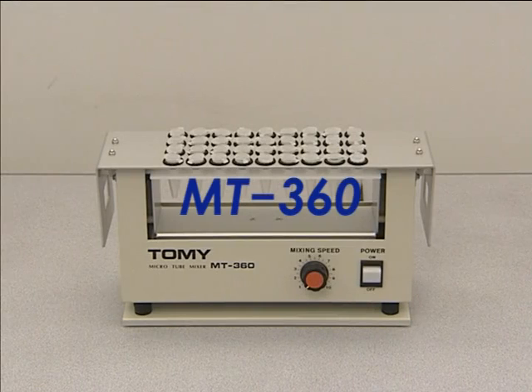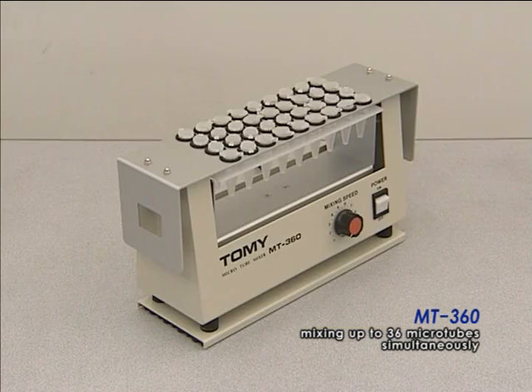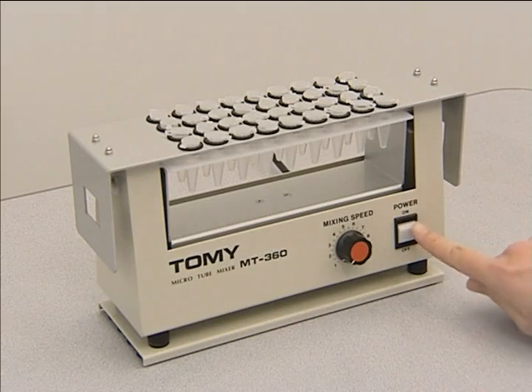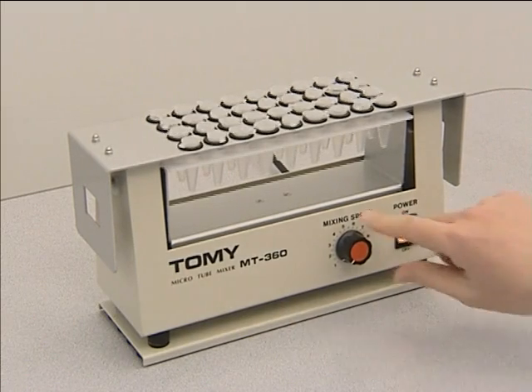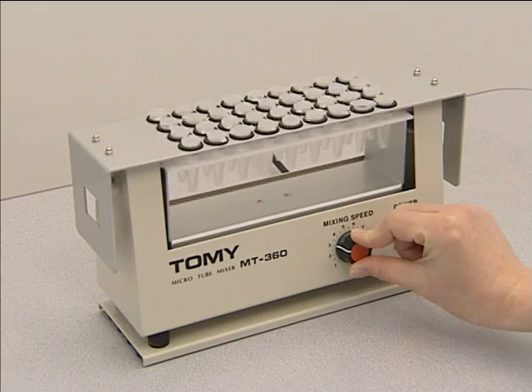Our MT360 Microtube Mixer features large processing capacity and is capable of mixing up to 36 microtubes simultaneously. It employs a unique eccentric vibration method as its stirring style and provides effective mixing. To set the mixing speed, simply turn the dial to your desired speed.